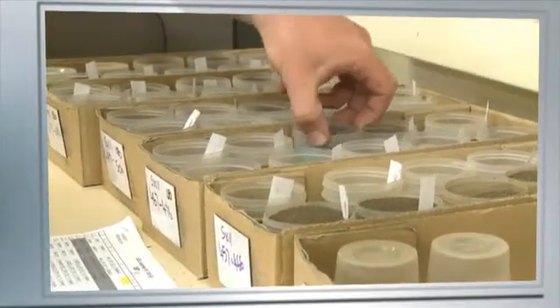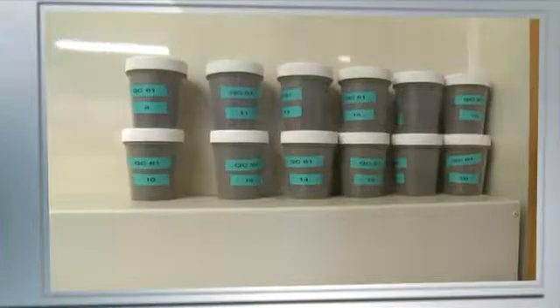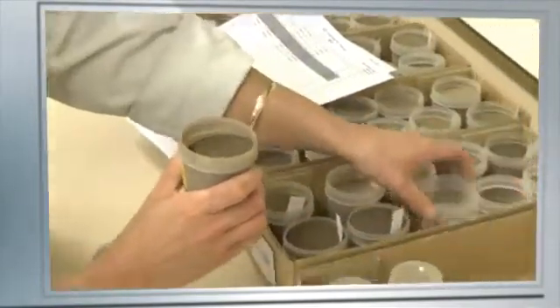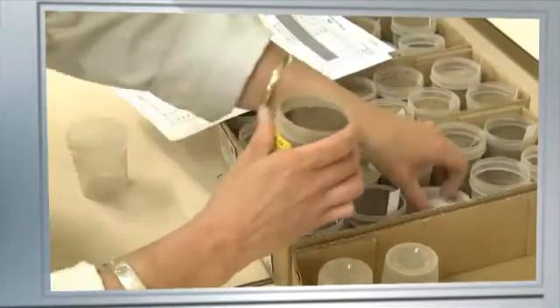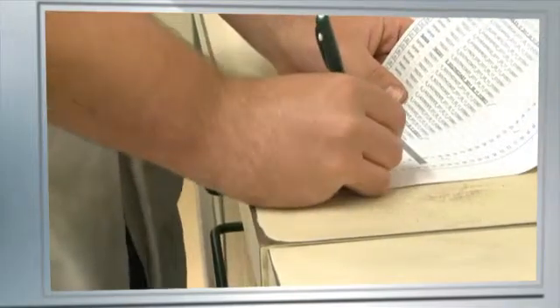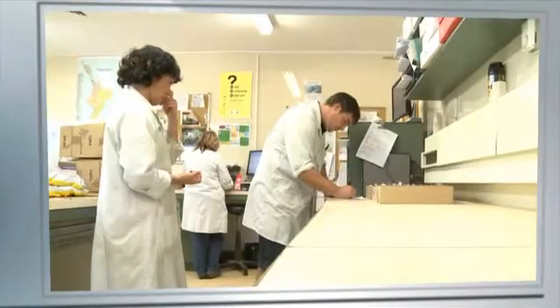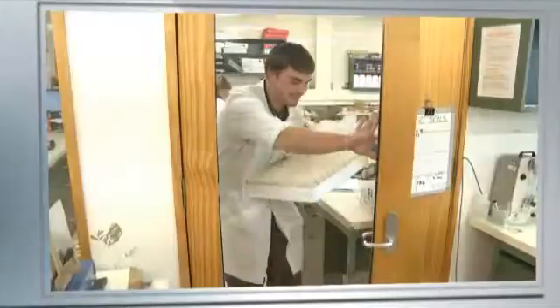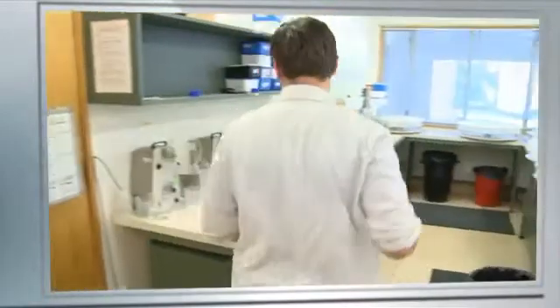A check sample is a sample of known value which also goes through the testing process. Should a check sample not match the known outcome for that test, an issue may have arisen which could have affected the accurate outcome of your sample's results. Quality is a critical component for ARL, and if check samples do not conform to expectations, then the whole job will be repeated. The samples are then sent to the lab for extraction.